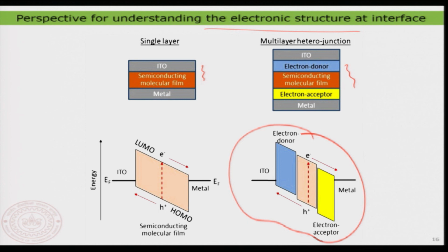It is quite important that we understand clearly the interfacial electronic structure, and that is exactly what I showed you in the previous example of any heterojunction. It can be a molecular semiconductor heterojunction or a semiconductor-metal heterojunction, whatever is your interest. You can clearly understand it using ultraviolet photoelectron spectroscopy, because it gives you a little bit more global picture than scanning tunneling spectroscopy. But scanning tunneling spectroscopy is also something one can use for understanding things at an atomic level.